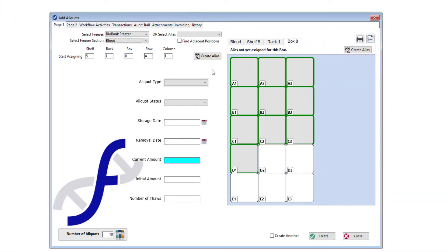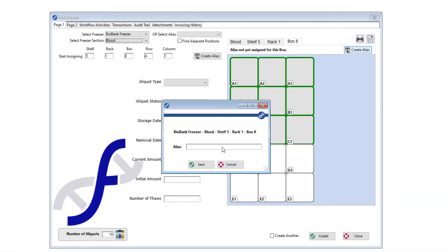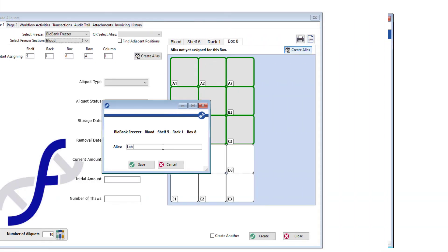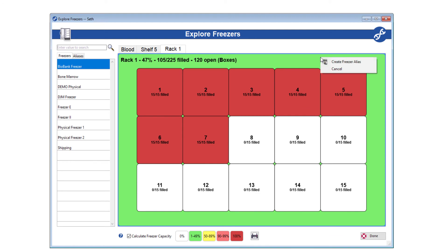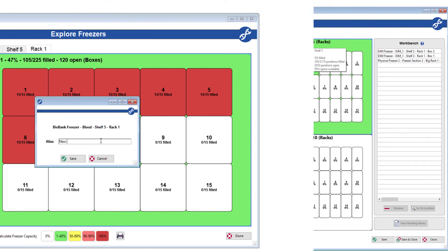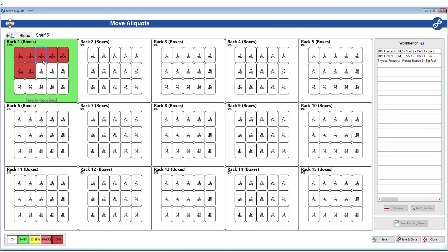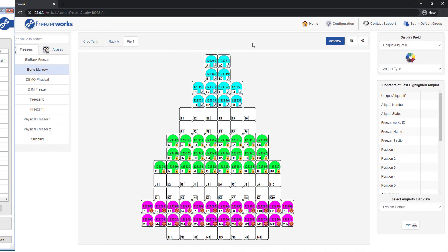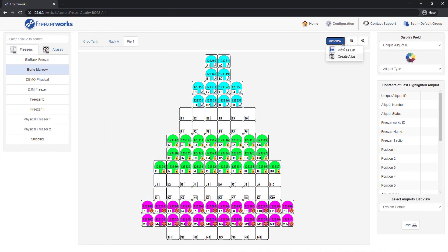In aliquots entry, explore freezers, and move aliquots. Of course, as you saw a moment ago, aliases will also be creatable on the web client.